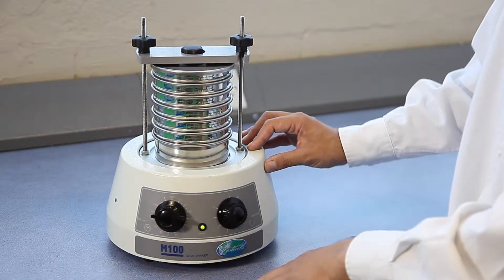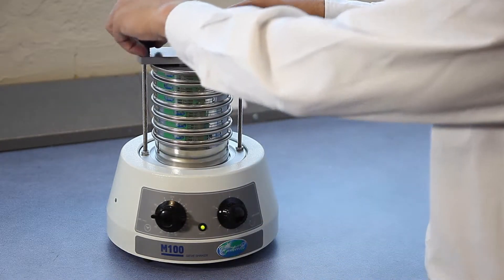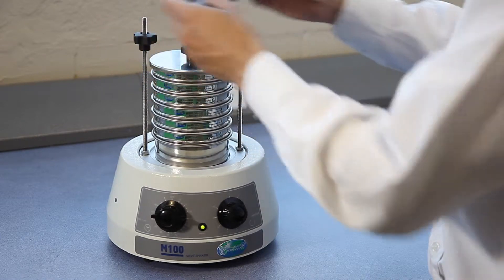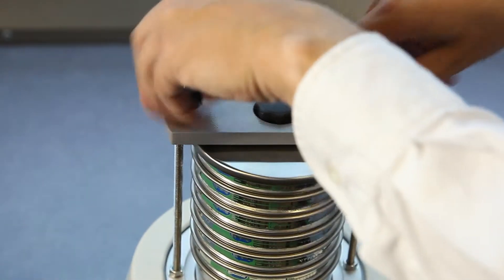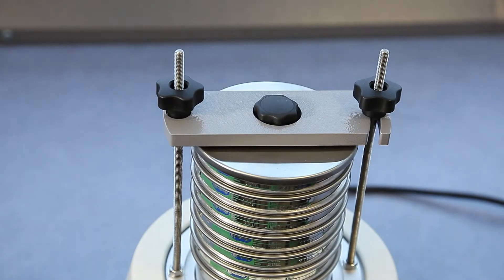The clamping mechanism has been specially designed for this machine and is very easy to operate and very quick, ensuring that no time is lost through difficult clamping.